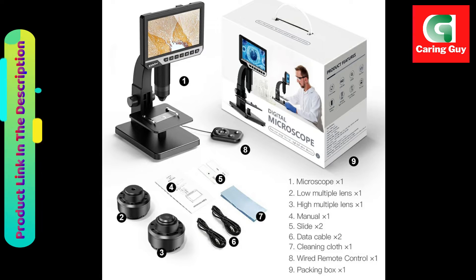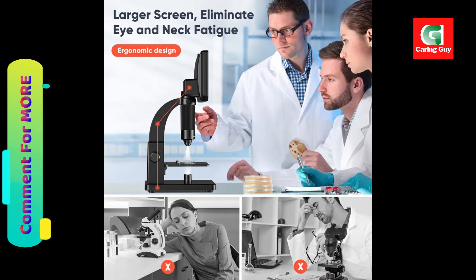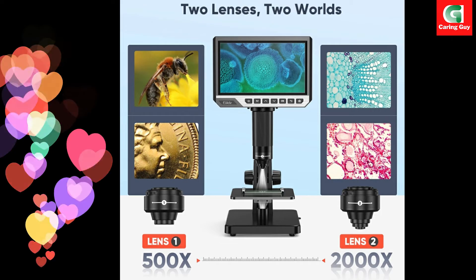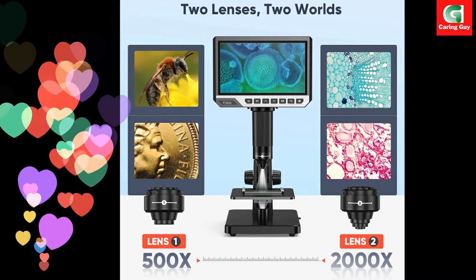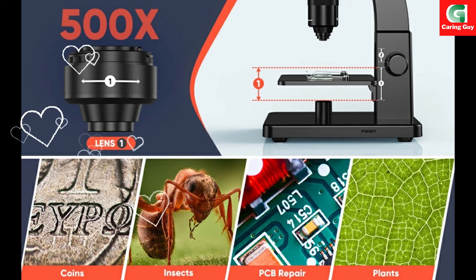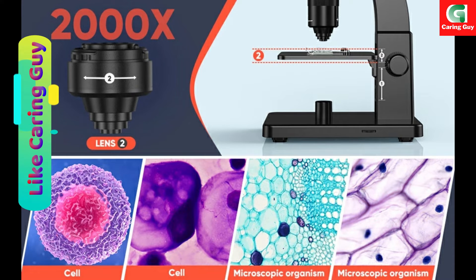Featuring a large 7-inch IPS LCD screen, the EDM11S provides a high-definition display with up to 2000X magnification. The screen's 1080p resolution showcases exquisite details and delicate images, making it an ideal size for comfortable and bright observation.